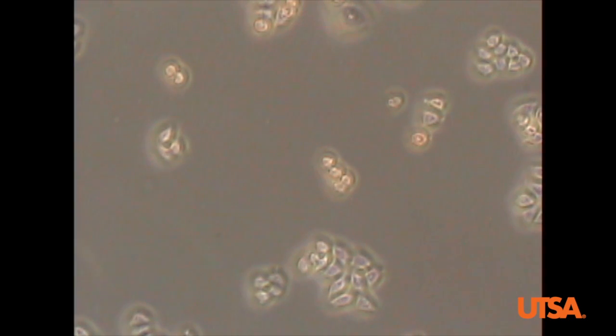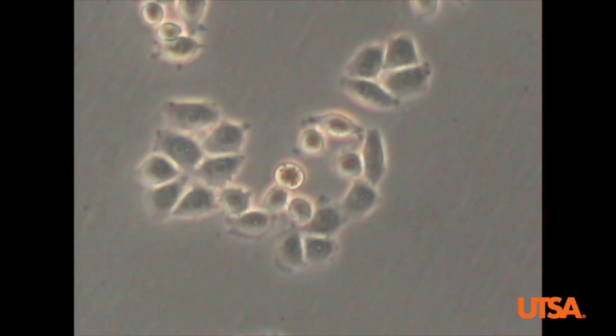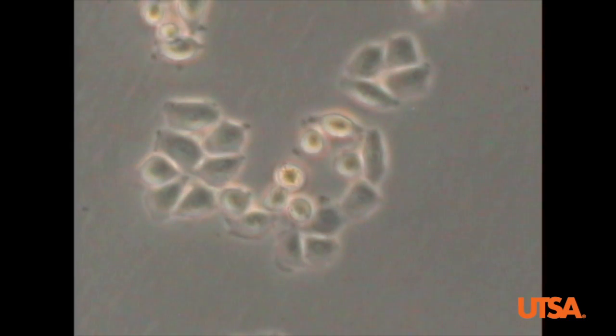Let's take a look at our cells now — they look much clearer. That's how we use an inverted microscope.